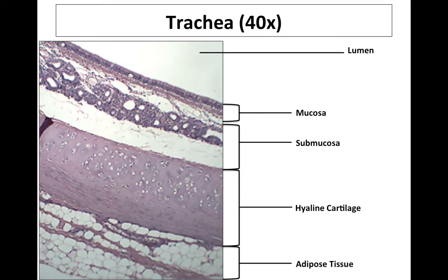In this video, we're going to complete the histology review that you're responsible for in the lab regarding digestion, respiratory system anatomy. If you've already gone through the video about the digestive histology, you'll notice that it has a similar distribution of tunics that you would have seen in an alimentary canal organ. In fact, in our lab, the esophagus and the trachea cross-sections are on the same slide.